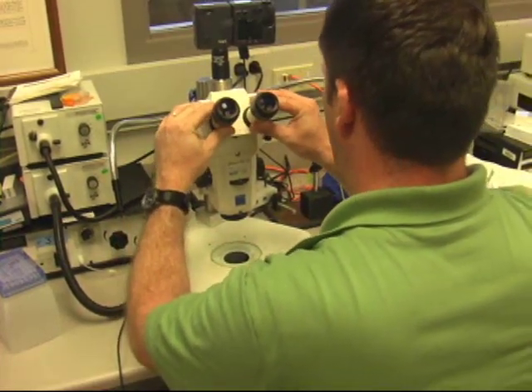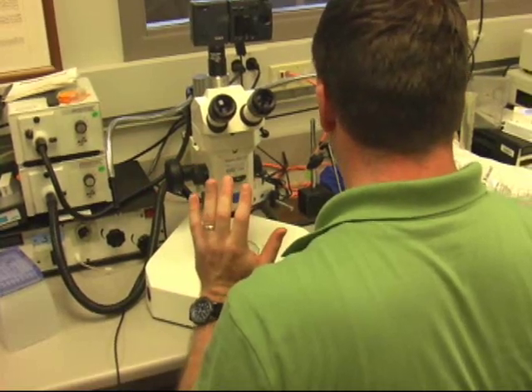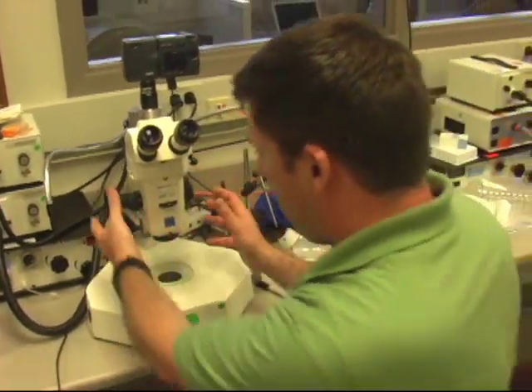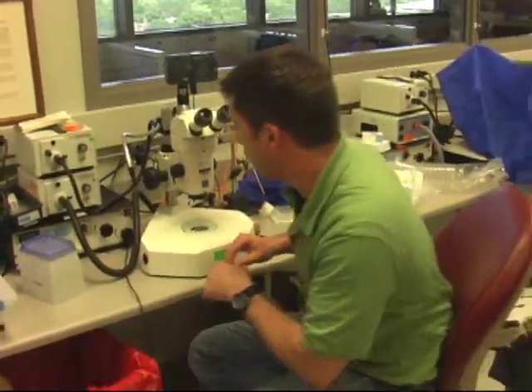What I'm going to do first is put some embryos up here and have you just take a look and get comfortable with the scope. As soon as you're comfortable just manipulating these things, then we'll move on to going ahead and taking a picture.